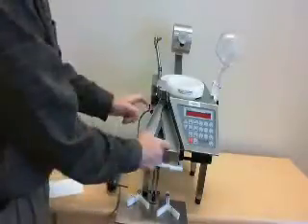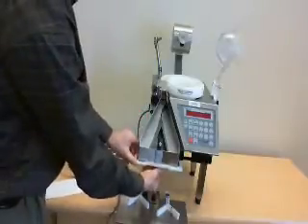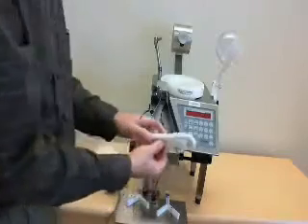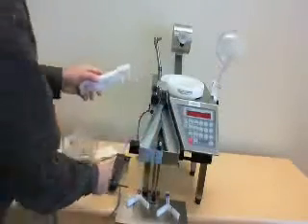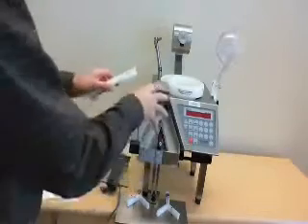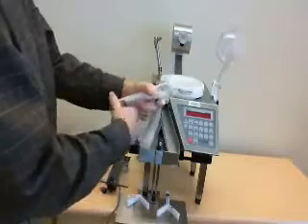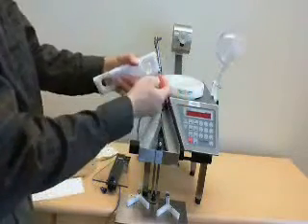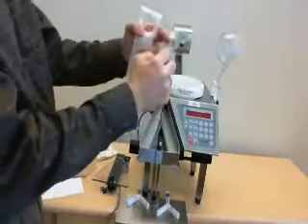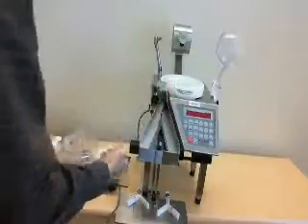Next, we're then going to disassemble the stainless steel and plastic components here. This is a thumb screw on the bottom. You should not need any tools when you are operating this device. Everything is thumb screw or snapping into place. There are two funnels on the bottom. The KL50icf comes with 2 different sizes, a wide mouth and a narrower mouth, depending on the tablets that you're currently counting.